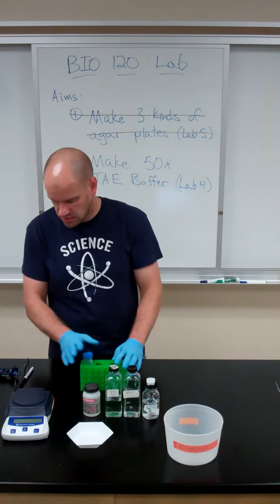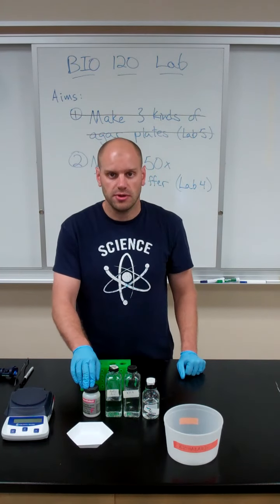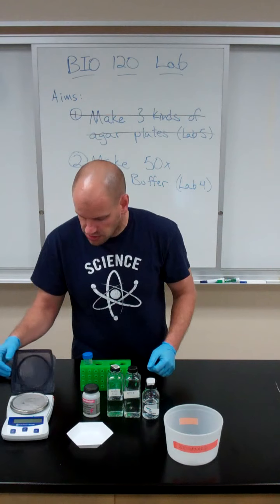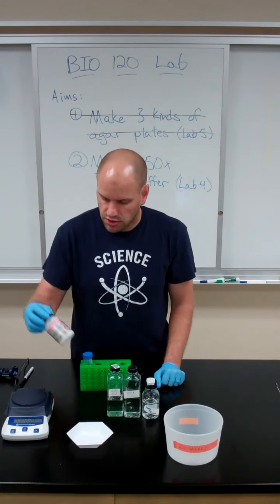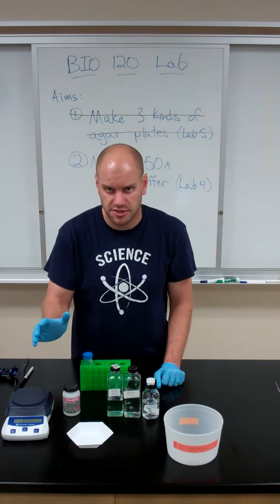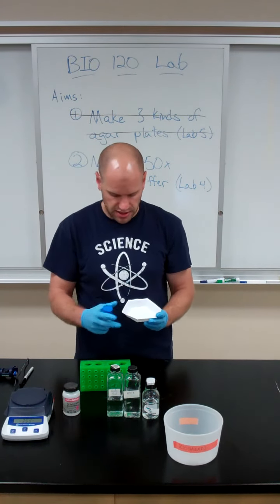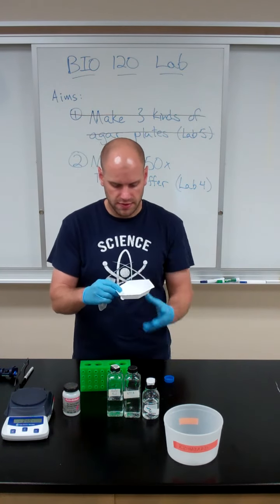With the tube labeled, we're going to add our ingredients: Tris powder, acetic acid, and EDTA. We'll use our scales to measure out the Tris powder — maybe in a bottle like this or some other container; pay attention to the labels. I've measured mine out in my weigh boat, so I'm just going to add that to my Falcon tube.